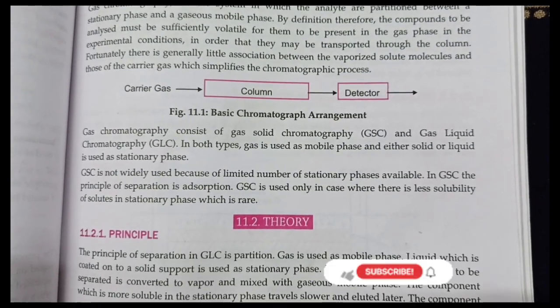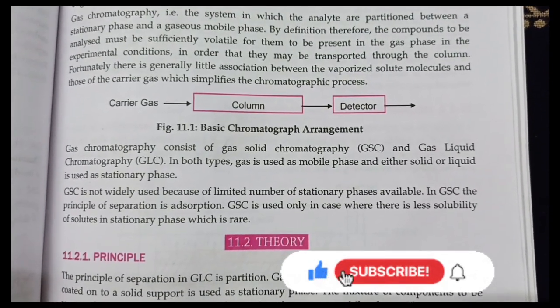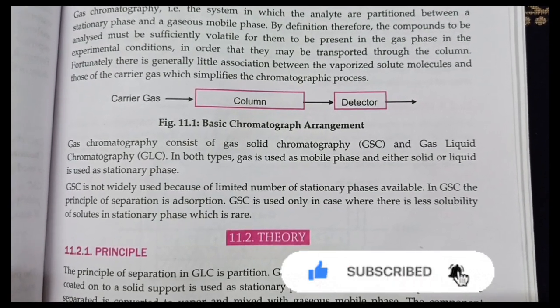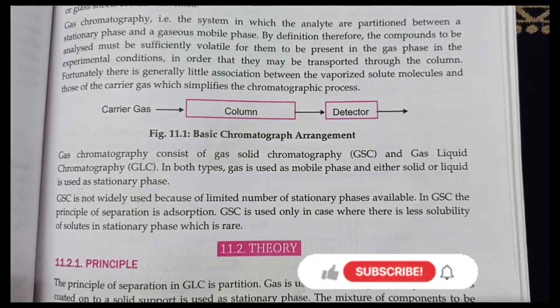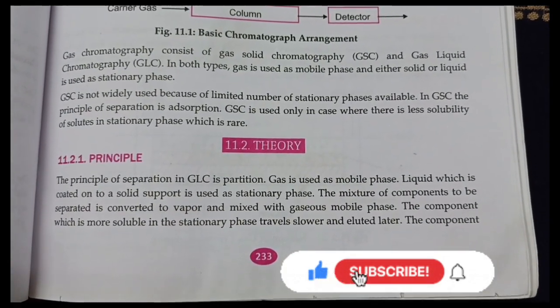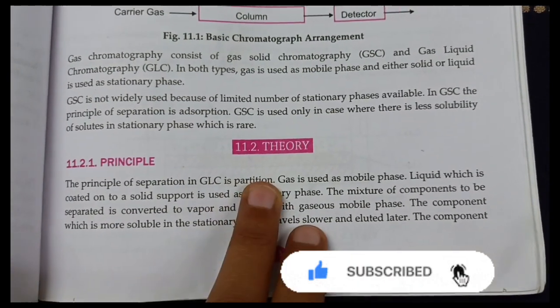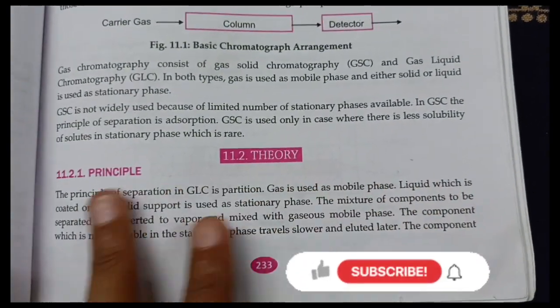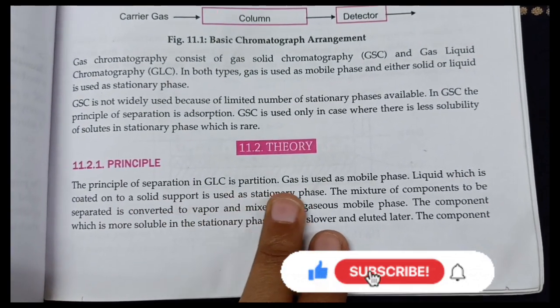In gas solid chromatography, the principle of separation is adsorption, and it is used only where there is less solubility of solutes in a stationary phase, which is rare. Principle of gas chromatography: the principle of separation in gas liquid chromatography is partition, and gas is used as the mobile phase. Liquid, which is coated onto the solid support, is used as the stationary phase.